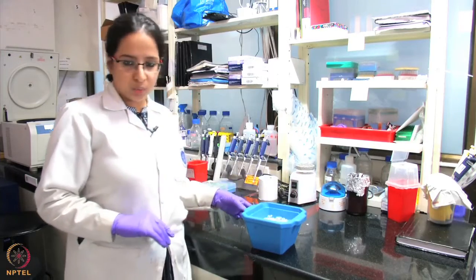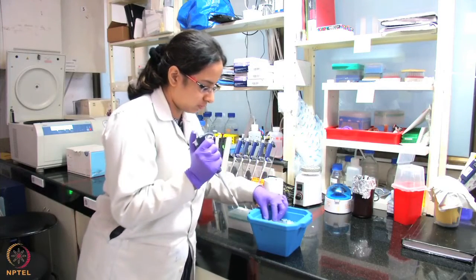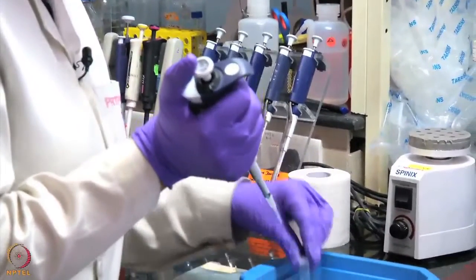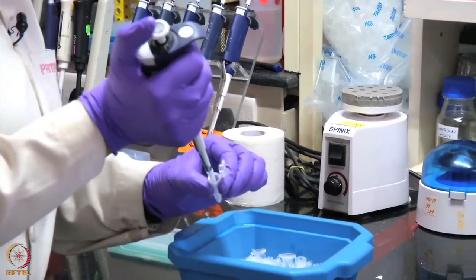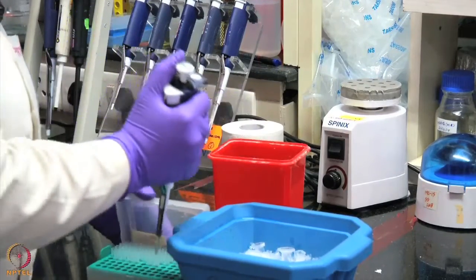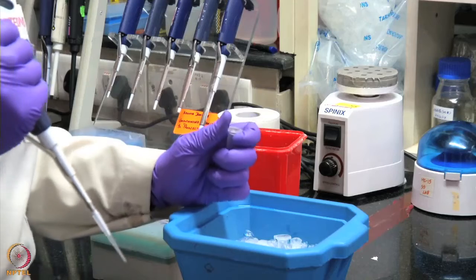What we need to do is, first we take our vector, then we add the restriction enzyme buffer which is needed by the enzyme to carry out the digestion.